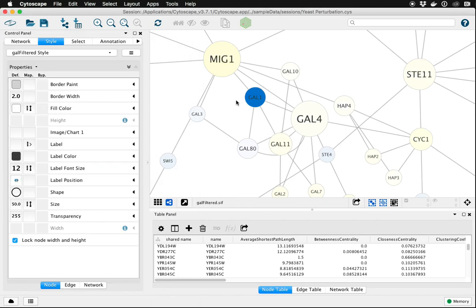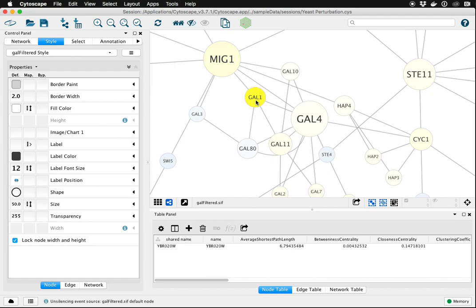If you don't want to do that, the other option is to control the color of the label. And since in this example there's only one that's really problematic, we can just select that one and provide a label color bypass.